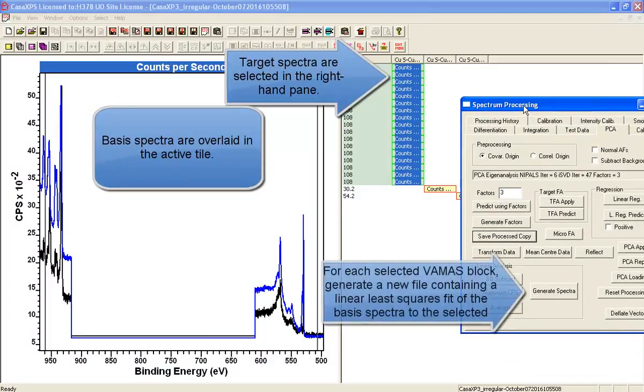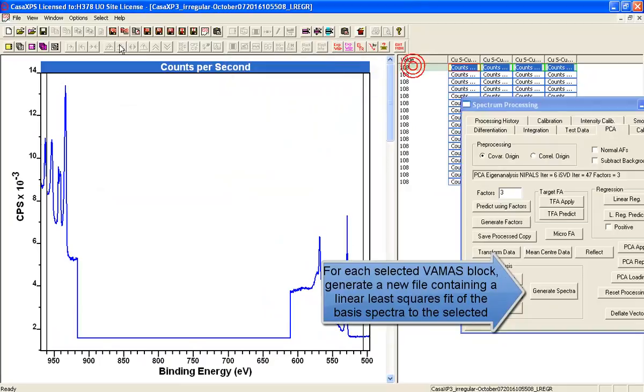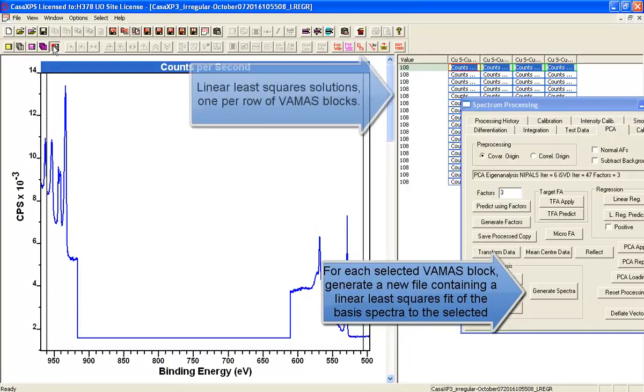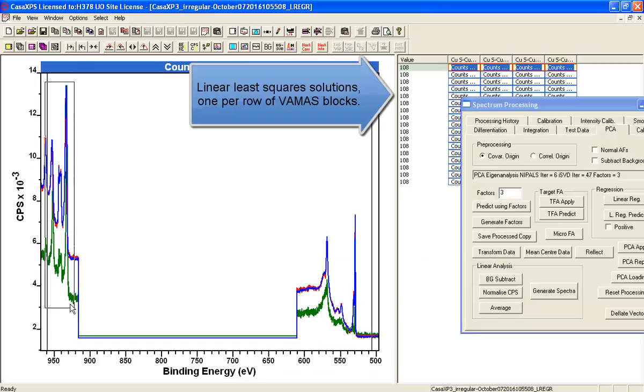And what we'll do just to assess this is to create a decomposition of the entire dataset using the two component shapes that we've calculated.